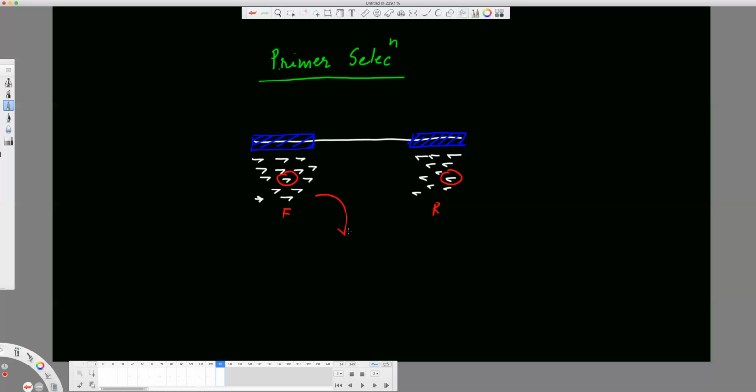So we have to score them, or penalize them, in score or the penalty. Okay, so if score is high, the penalty should be lower, right? So either you score them and then you look at the maximal score, or you penalize them based on certain properties and say that I will choose the pair which is having the least penalty score. So this is how we select the best primer pair.